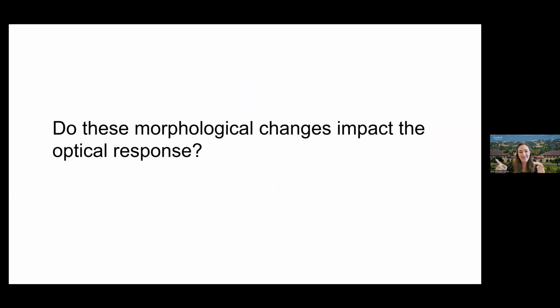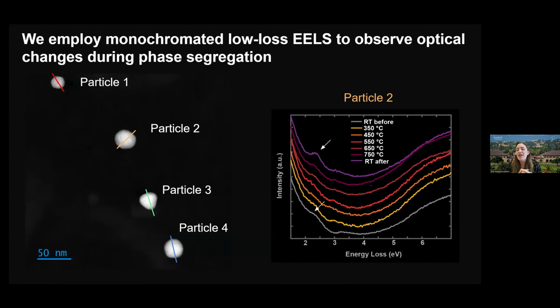So we're doing photocatalysis, and our first question was, how is this structural change impacting the optical responses of our crystals? We had to answer this using monochromated low-loss EELS. We observed the plasmon of these catalysts, which is around 2.5 eV, and watched its evolution during phase segregation. To do this, we took line scans of each particle and averaged them to get a surface-averaged response, which is plotted here on the right.